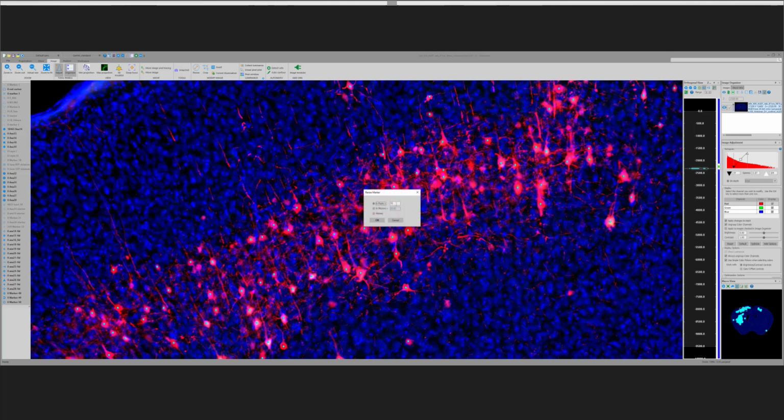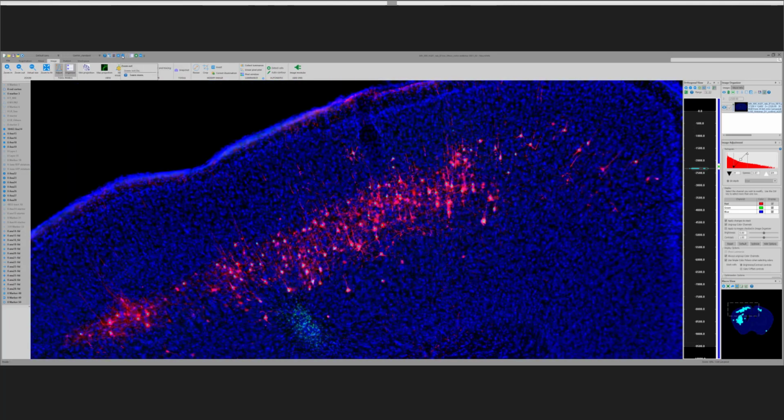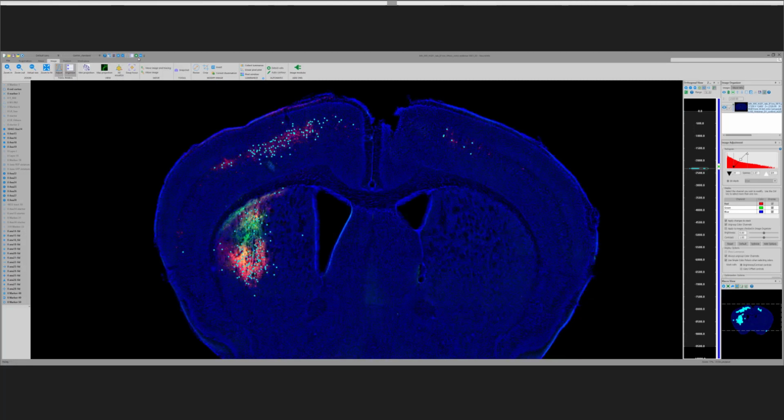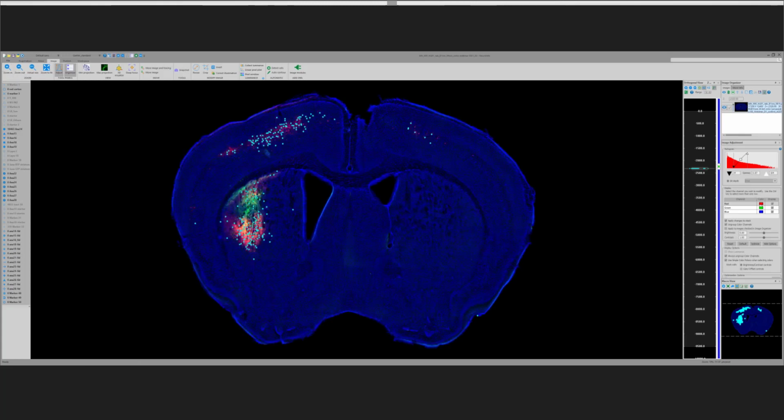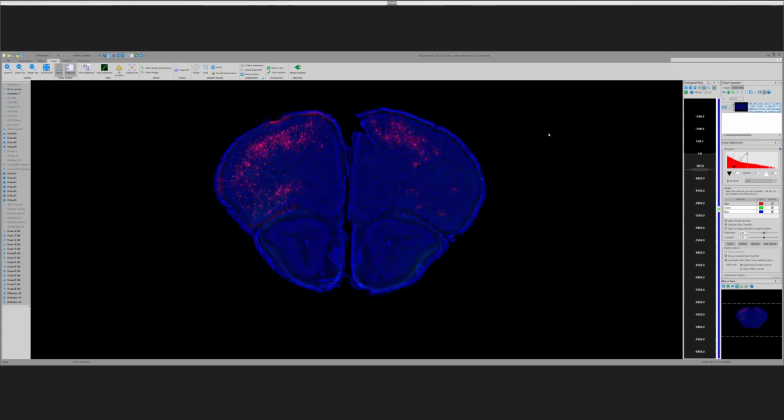Over here, I can change the size of the markers. I'm going to pan out a little bit. In this window, we can navigate and change the markers and either view markers or turn them on and off. And in the actual experimental brain case, as I said, we can go to the front of the brain, looking at where the cortical neurons are, and I can scan through.